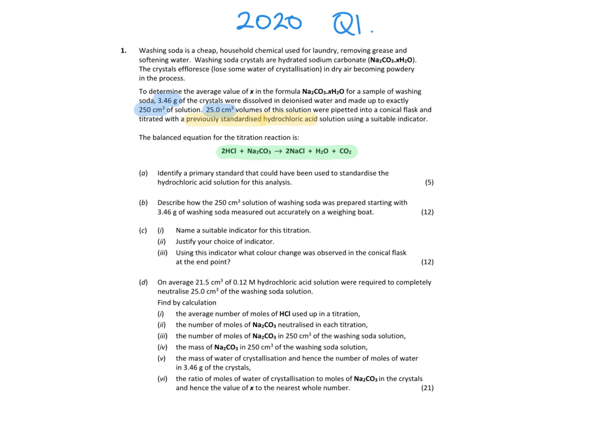Now, we've already highlighted our balanced equation in green, but I'm going to go over it now a little bit with you. So what I'm going to do is, we can see in the theory parts of the question above, I've highlighted the hydrochloric acid in yellow, so that's what I'm going to do here. And I've highlighted anything to do with the sodium carbonate in blue, and that's what I'm going to do.